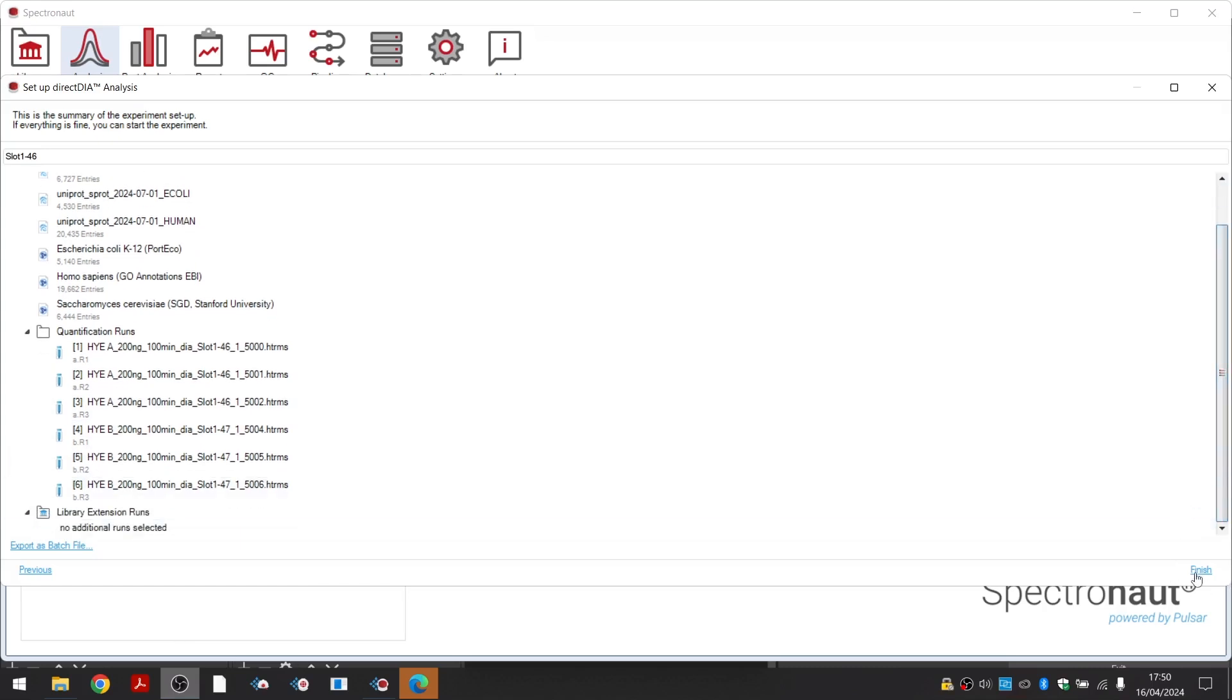Once the analysis is finished, you can review the results of the analysis in the form of multiple graphs at the run, protein group and precursor levels. There is plenty of information to explore.